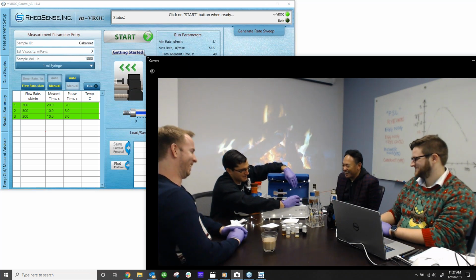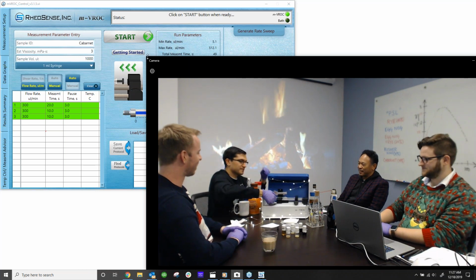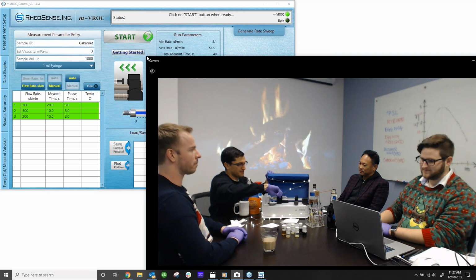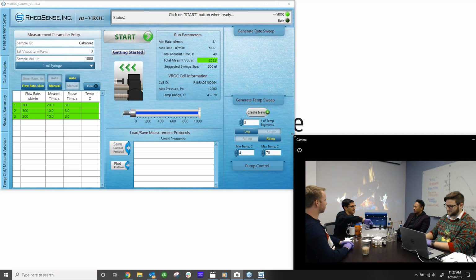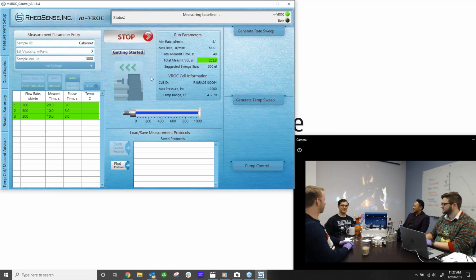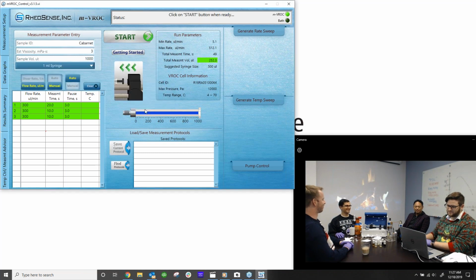Push your block. Lock it. Open the valve. And then secure the jacket. Well done. It's like I've been doing it my whole life. All right, plunger's been contacted, so we can start our run.